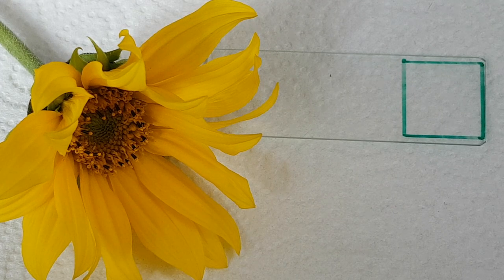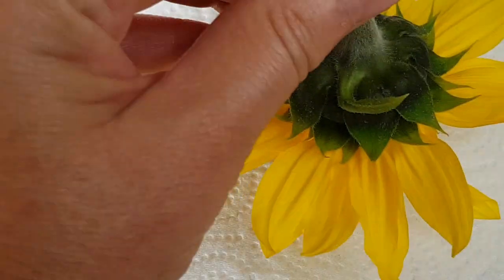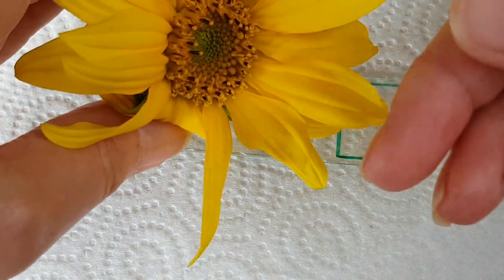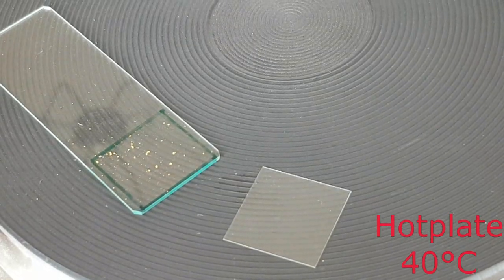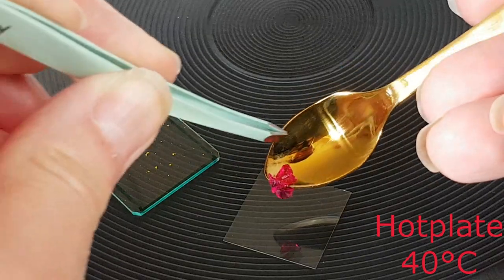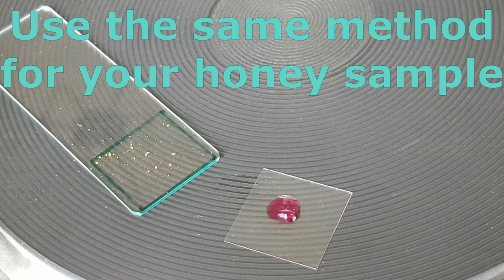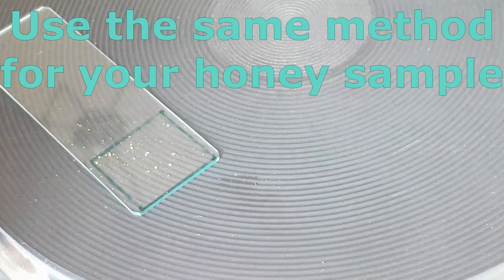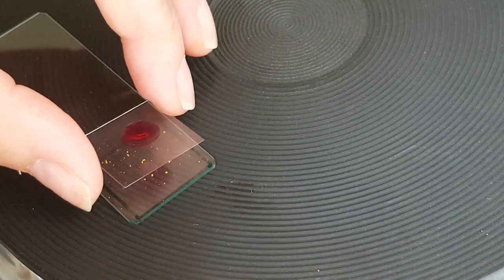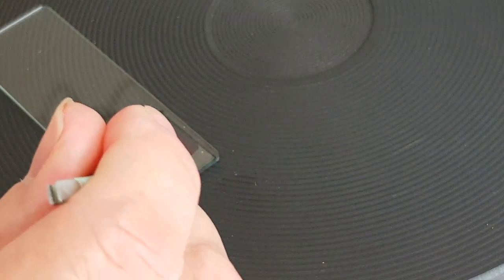Here's the sunflower. I've just prepared a slide so I can put the pollen into that little square there. I'll dismantle the flower and take the petals off so the anthers are more exposed. I'm warming through my cover slip and my slide with the pollen on it. The smallest amount of glycerin jelly goes in the middle of the slide - that will melt. The next bit is really tricky: I don't want to put my fingers over the slide, I just want to pick it up on its edges and gently place it over the top to create a nice seal. It's incredibly delicate.